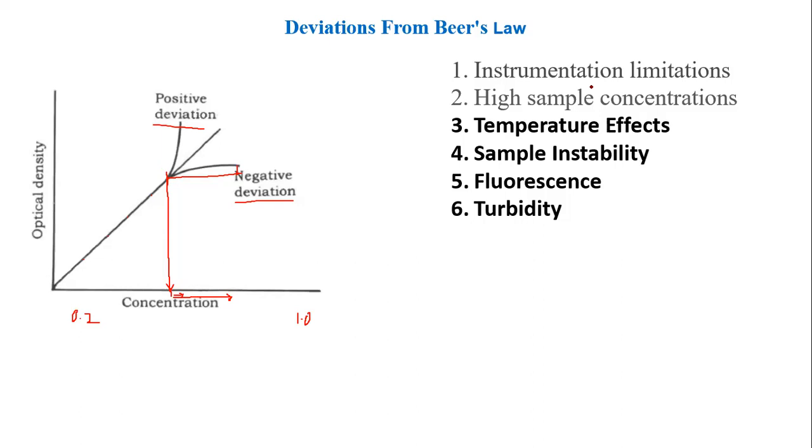In that situation, we think that there could be an instrumental error. However, this is a very less probable situation, and this happens only when there are power fluctuations going on while you are taking the absorbance values.